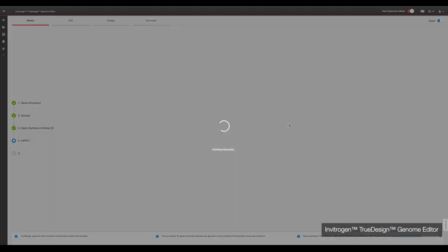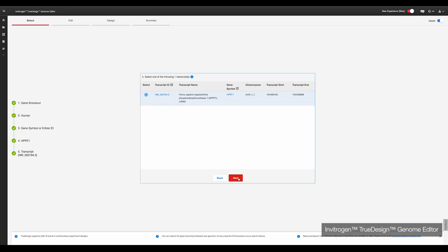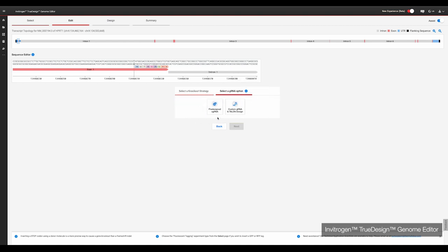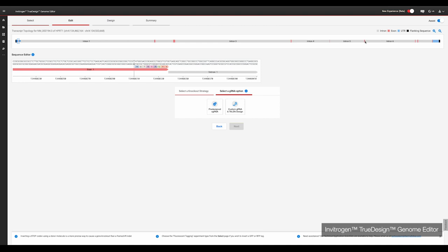Next, you will pick the transcript of your gene you wish to target. You then need to select the type of knockout edit you wish to perform. Today we will use frameshift indels. True Design gives you the option to use pre-designed gRNAs that will target the first exon of a gene, or custom gRNAs using the gene navigator. Today we will use pre-designed synthetic gRNAs.